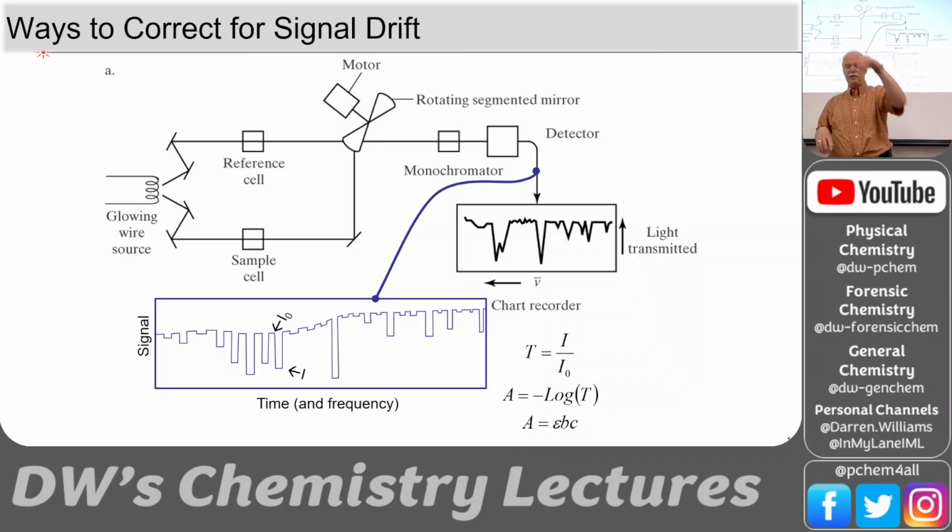And then you set it aside and you do your test tubes and you put them each in at one time. Okay, what happens? You measure your blank, okay? And you're using your source, goes through your blank, hits the detector, you set that to 0 absorbance. You pull your blank out, you put your sample in, and somebody gets in the elevator. What does that do? Drains the power grid and your source gets dimmer. And your absorbance on your sample, since the detector sees less light, says, oh, this absorbance is high. It's not. I mean, it's somewhat high, but it's even higher because the light went down. It got dimmer because of the elevator.